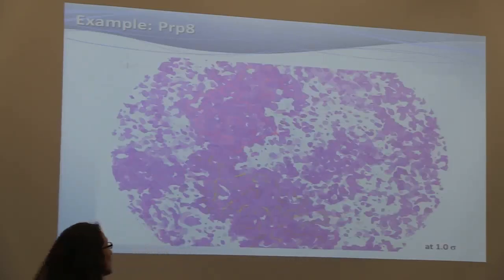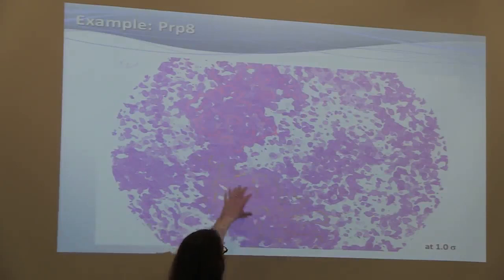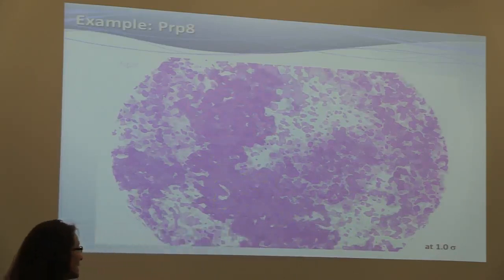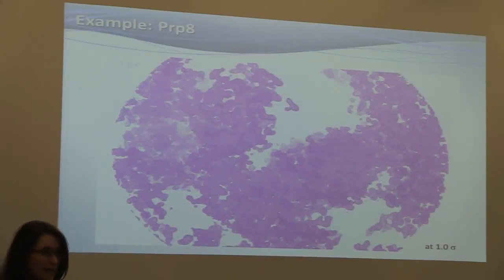That's what the map looked like after molecular replacement. You can see that the protein was rather well defined in the area where the search model had been placed, and there were some structures here that they couldn't fit something in. And then after SHELXE, the map looks like this. And that actually made a difference for PRP8 to be solved.